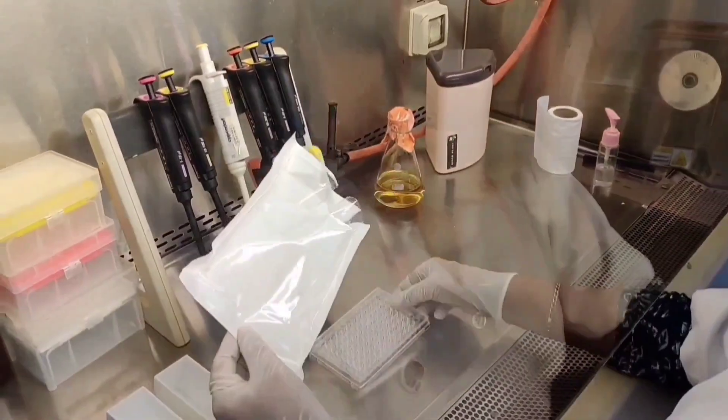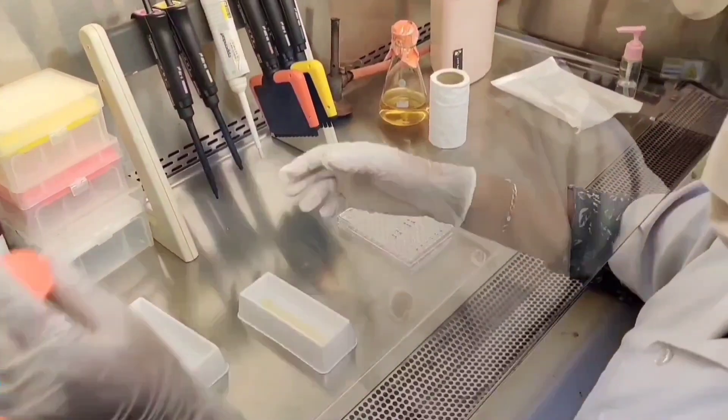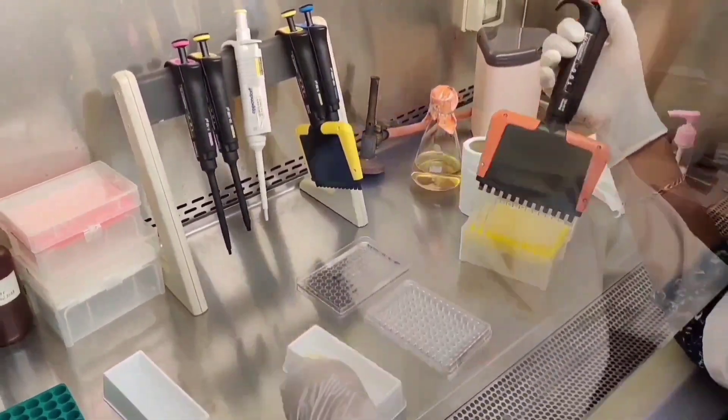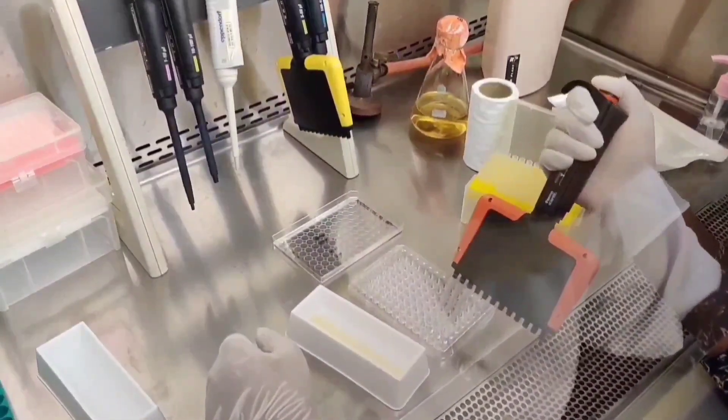Initially, a 96-well plate is taken and labeled clearly. 100 microliters of media is added to all the wells except the first three wells, to get the complete concentration.